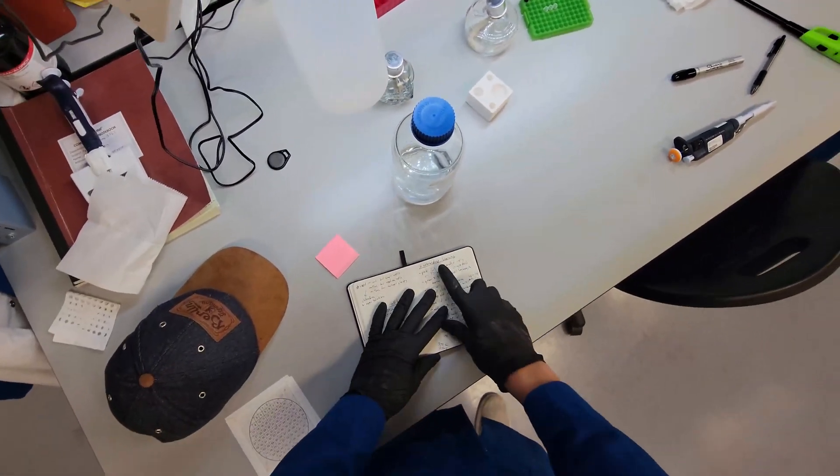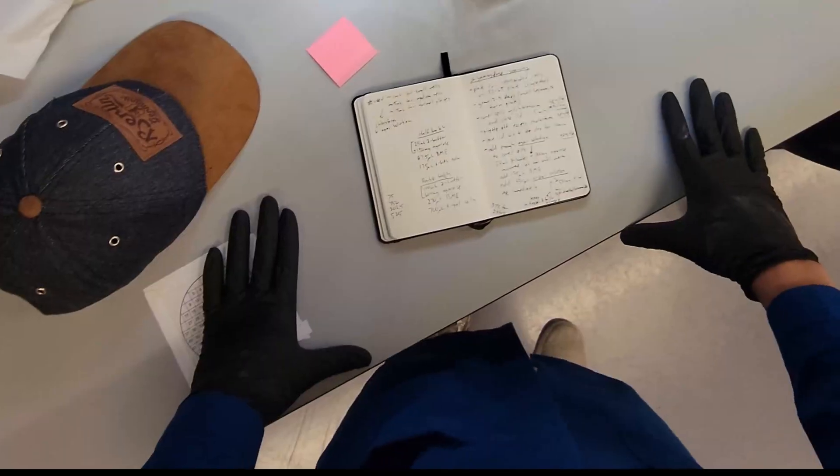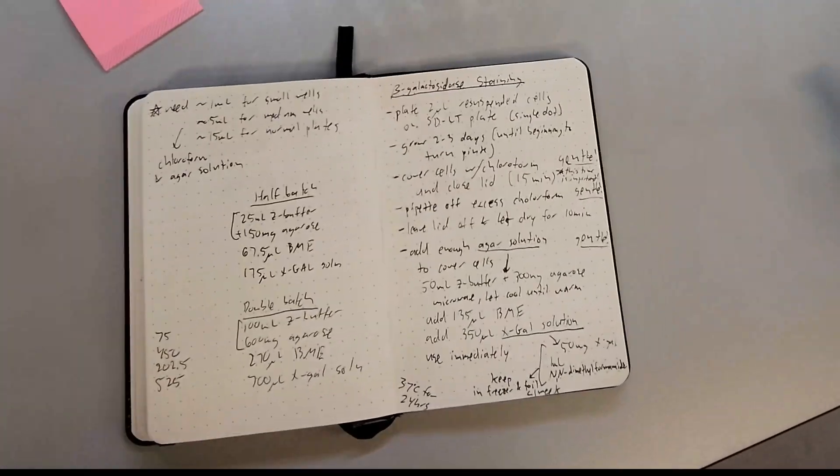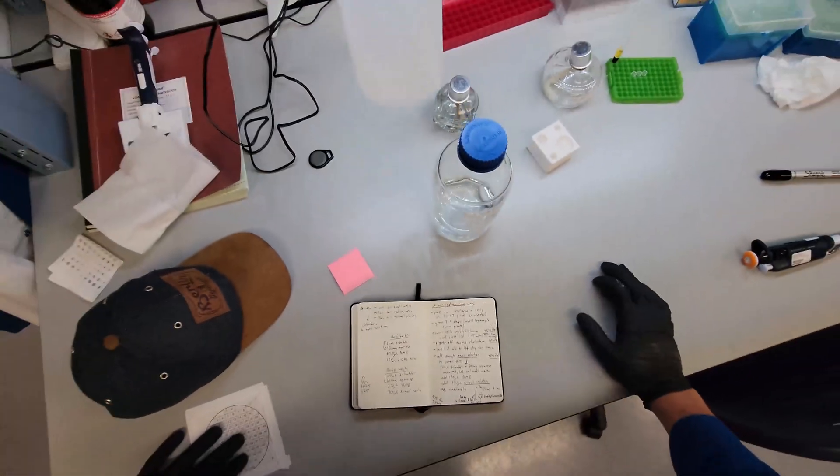All right, today I'm going to do a beta-galactosidase staining. This is the protocol here. You can pause, maybe read it, take a look.